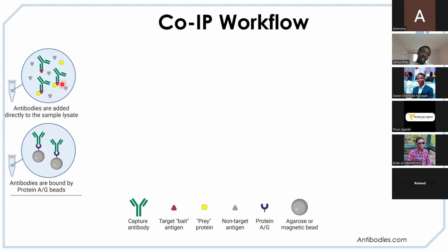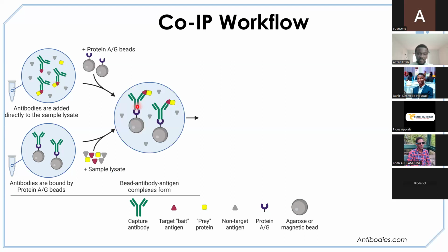So now this is still our protein A, but we suspect that the yellow one is, let's say, protein X. We believe protein A is interacting with protein X, okay? And so we develop antibodies against protein A, only protein A. Alternatively, we can also develop antibody against protein X. And if they are interacting, we should see this partner, whereby we are seeing protein A being bound to the protein X as well as the antibody.